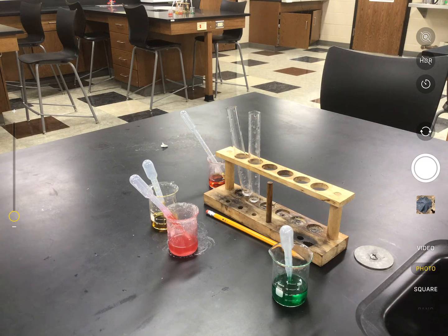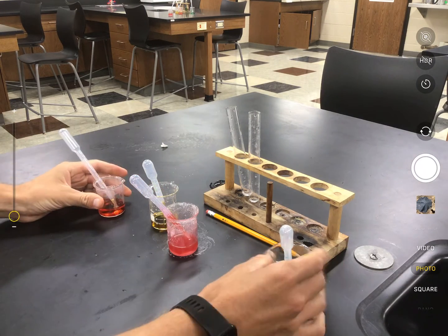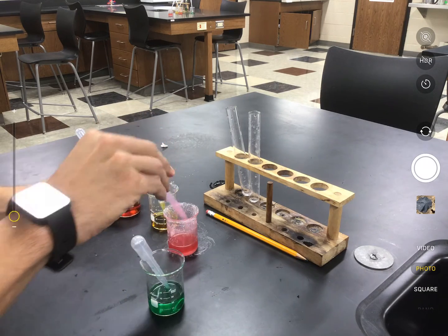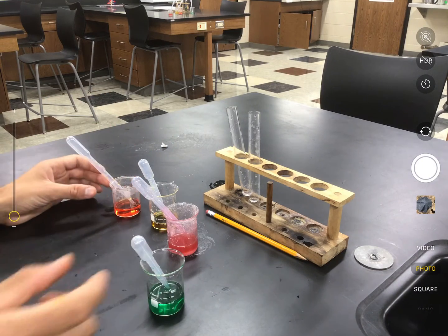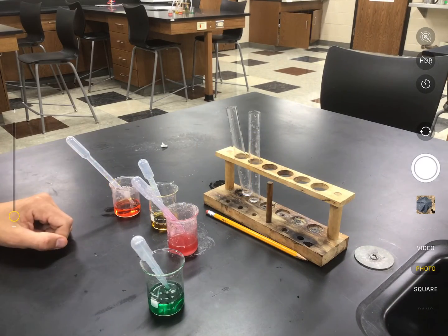Okay, so today, if you couldn't be here, we are sitting at a lab station where we're going to do a density lab. So what we have is four different colors of fluid, and in each liquid, we have a varying concentration of salt. So what I'm going to do is we're going to see the relative densities of each of these liquids by dropping a certain amount of them into a test tube on top of each other.